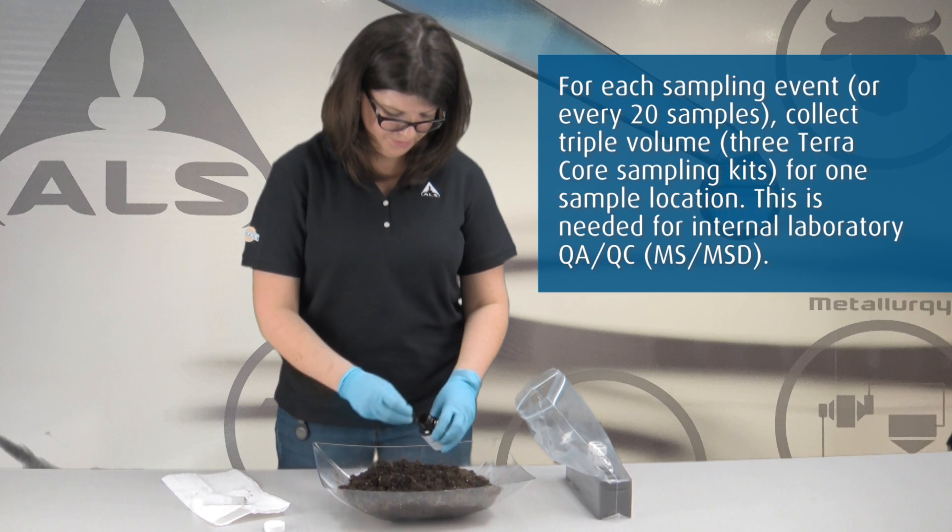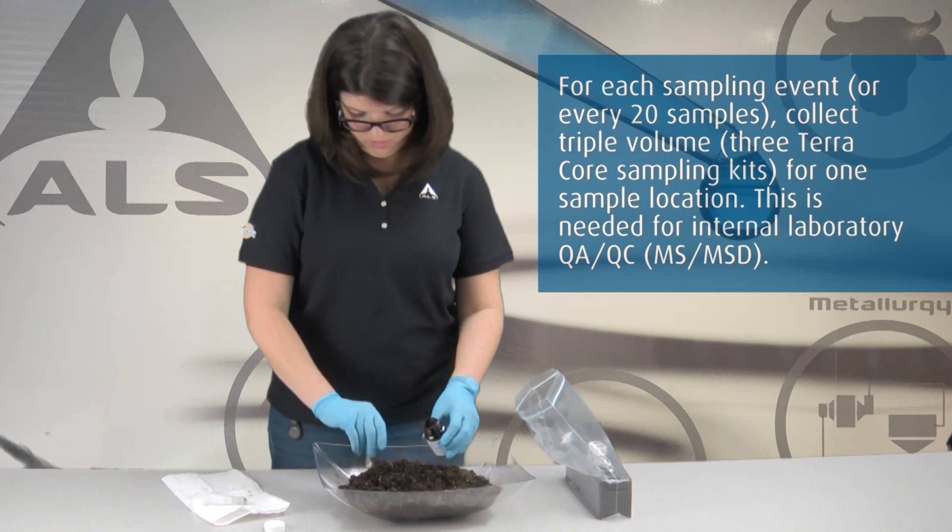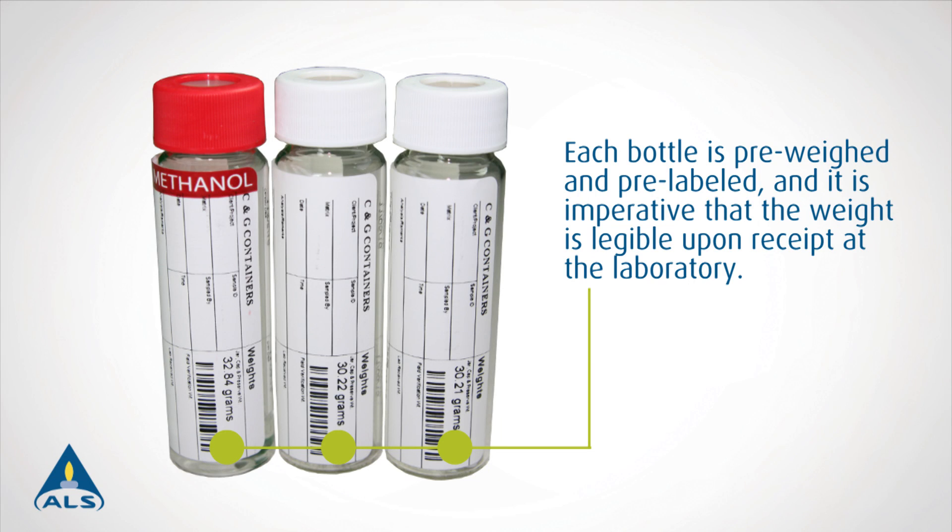Collect sample for the 60 gram jar using the bulk soil collection technique. Each bottle is pre-weighed and pre-labeled, and it is imperative that the weight is legible upon receipt at the laboratory.